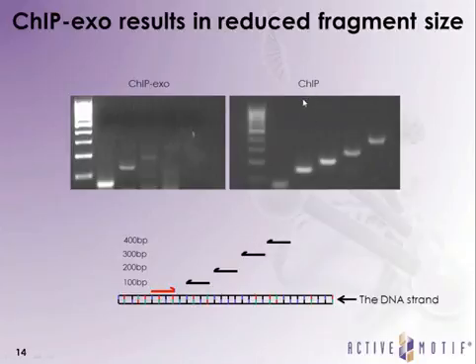So if you just perform ChIP with no ChIP-Exo, you see this very nice stair-step product that you get on your agarose gel out to about 380 base pairs in this case. Now, when we look at the ChIP-Exo treated DNA, we see that it has been trimmed back in that you still see the initial 89 base pair fragment or DNA product that you get from PCR, as well as the next 2 steps, but further on than that, there is actually no product being really produced.